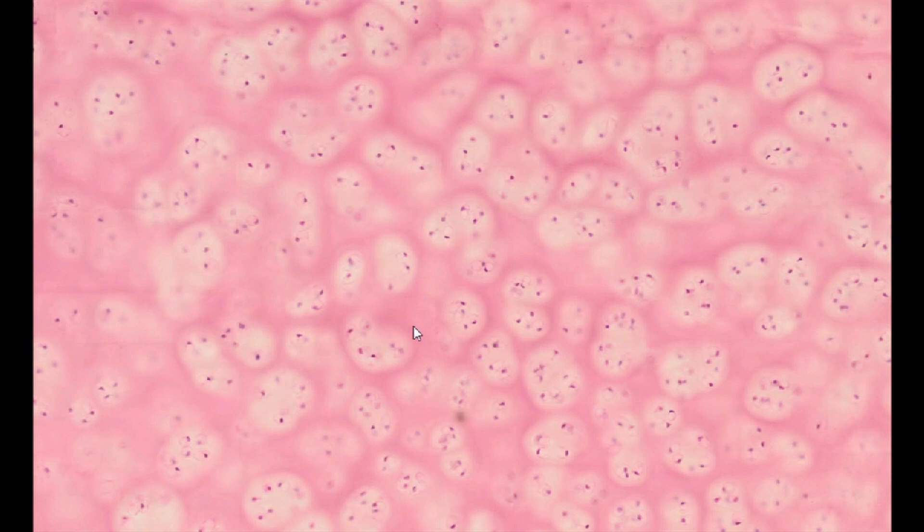Mature chondrocytes produce all the components of the cartilage matrix, which they deposit outside the cell. Thus, individual chondrocytes and cartilage territories move apart, enlarging the cartilage area, which is called interstitial cartilage growth.